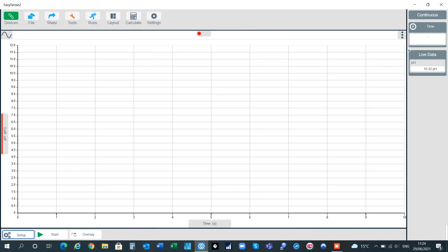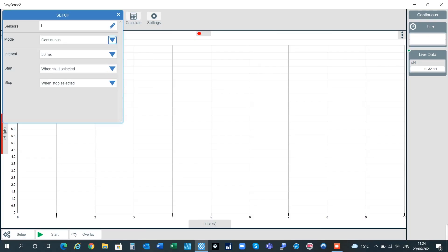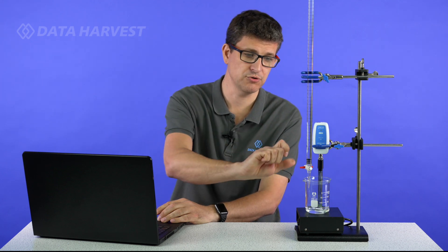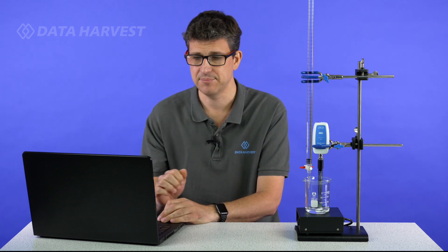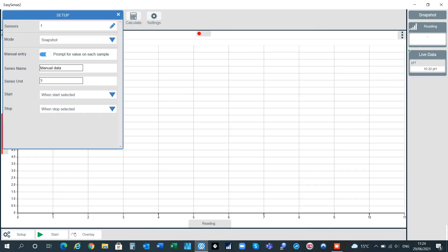We're going to set the EasySense2 software up to run the titration experiment. We go to setup. It defaults to continuous which is just a time graph but we can now change this to snapshot because we want to take a reading when I choose to take the reading so I could be more controlled when I'm also turning the tap. I do want it to prompt me because I'm going to add volume at the same time so we can plot one against the other. The series name is going to be volume because that's the extra one I'm adding and it's cm³.